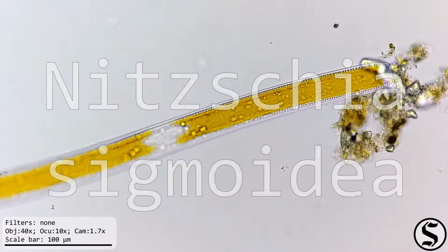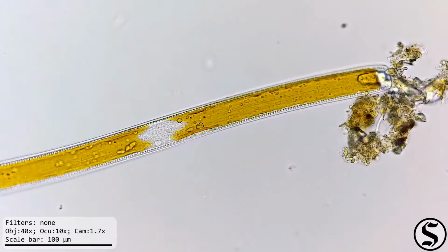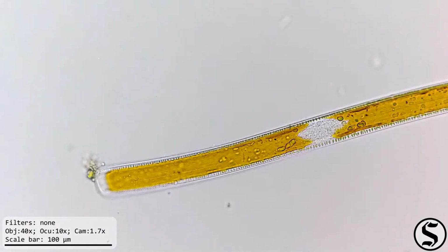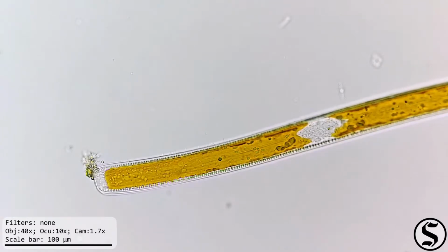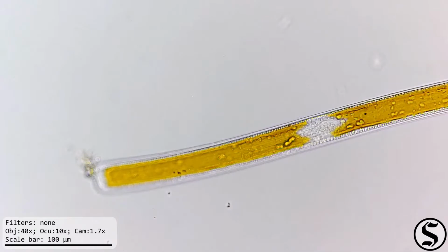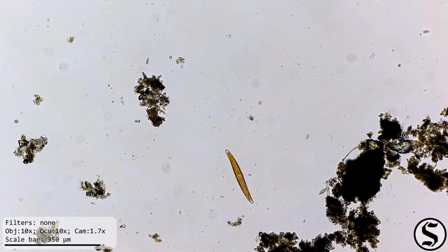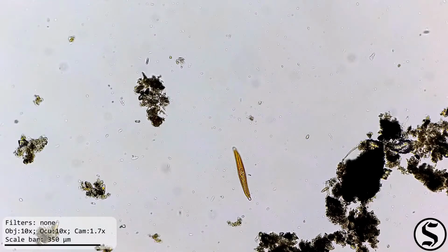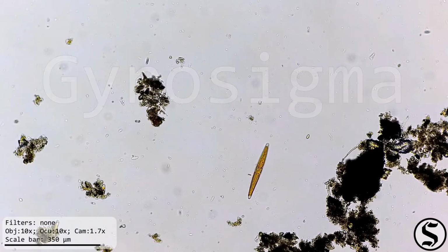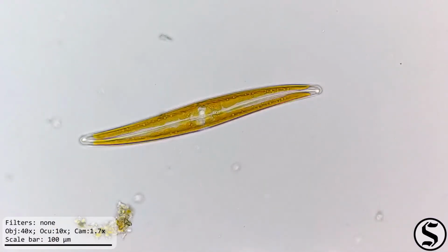The genus is named after the guy who discovered them, and sigmoidea just means that it's shaped like an S, from the Greek sigma. And here's another sigmoid diatom. This one is of the genus Gyrosigma. That comes from the Greek gyros for round and sigma again.